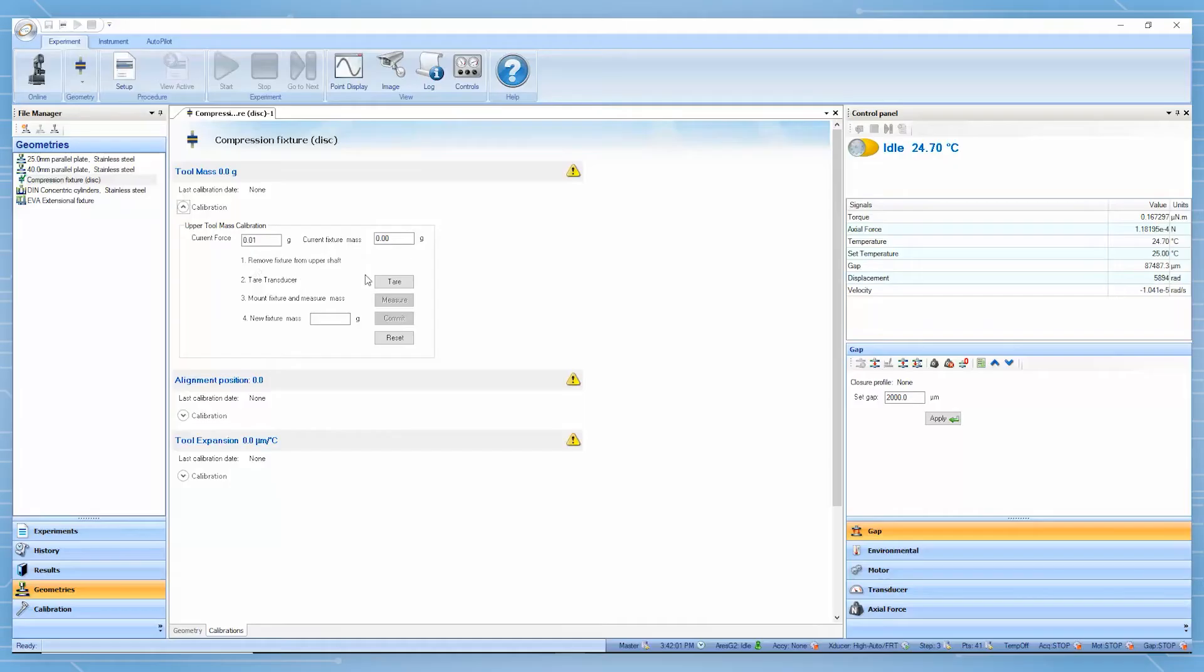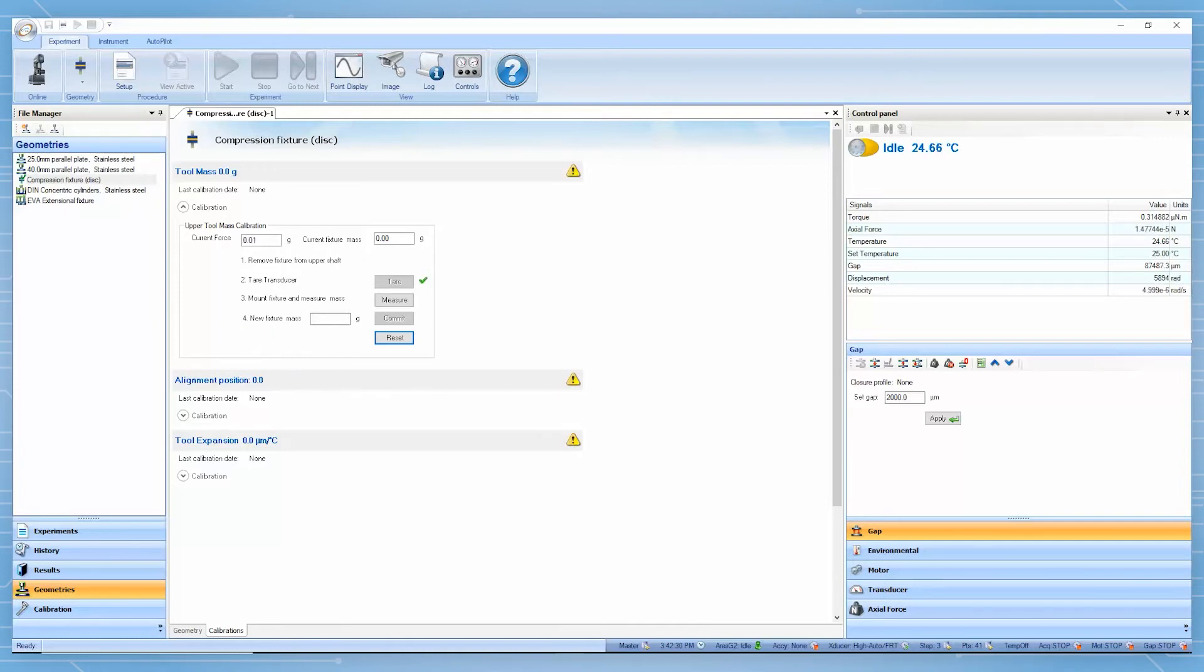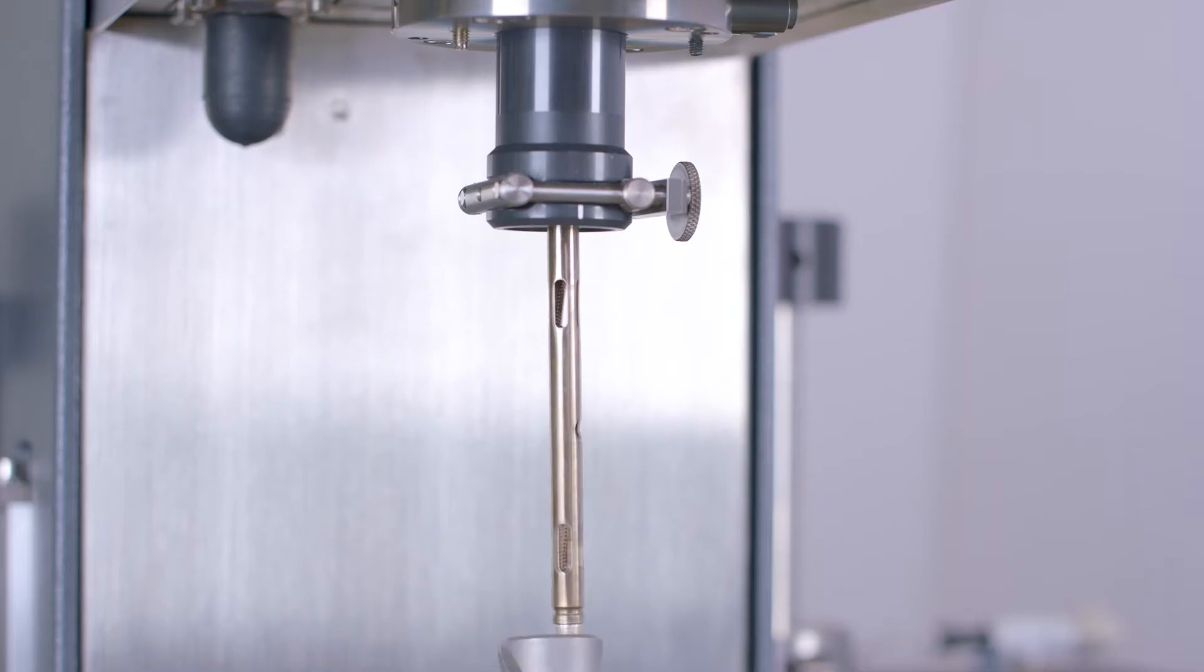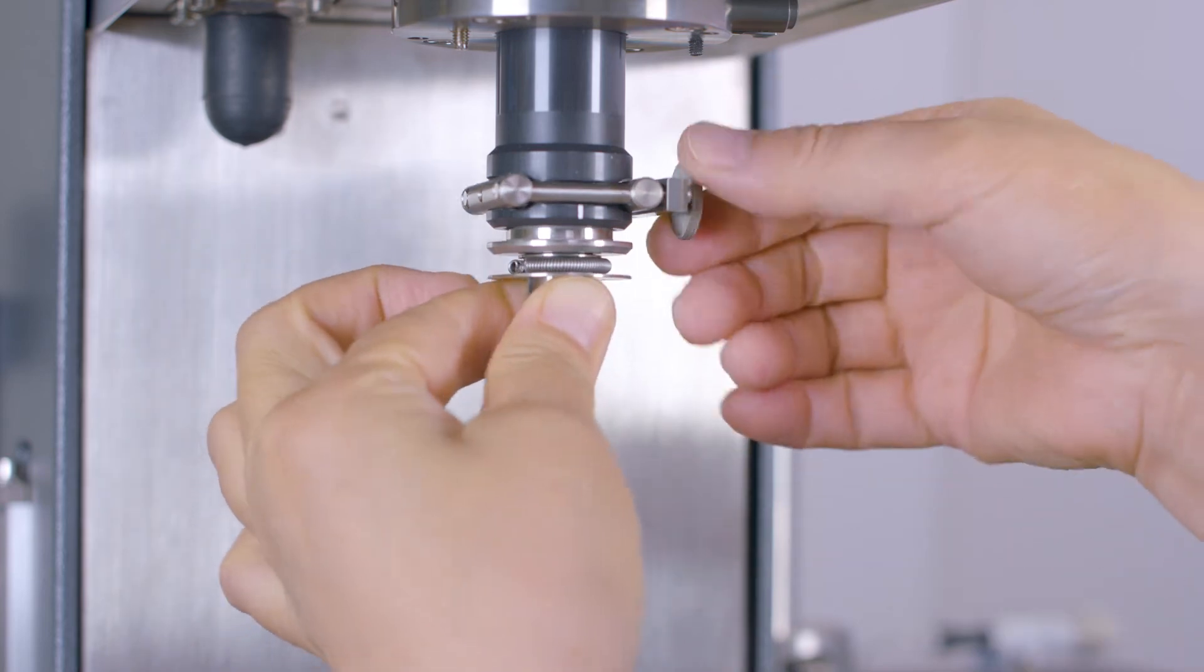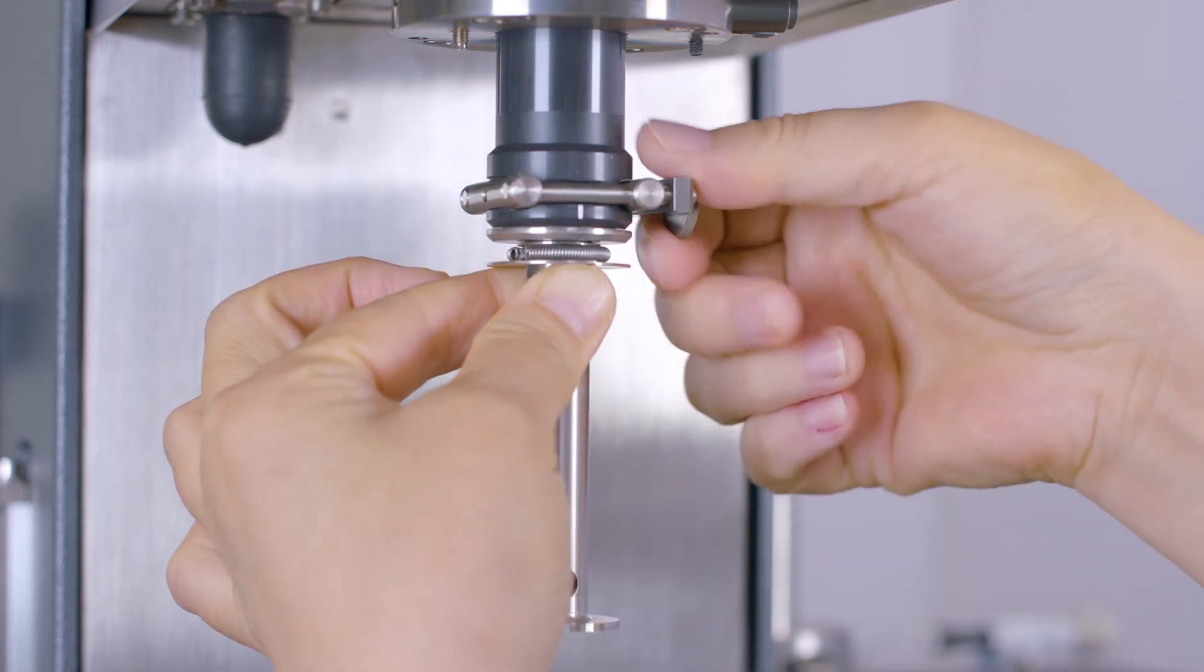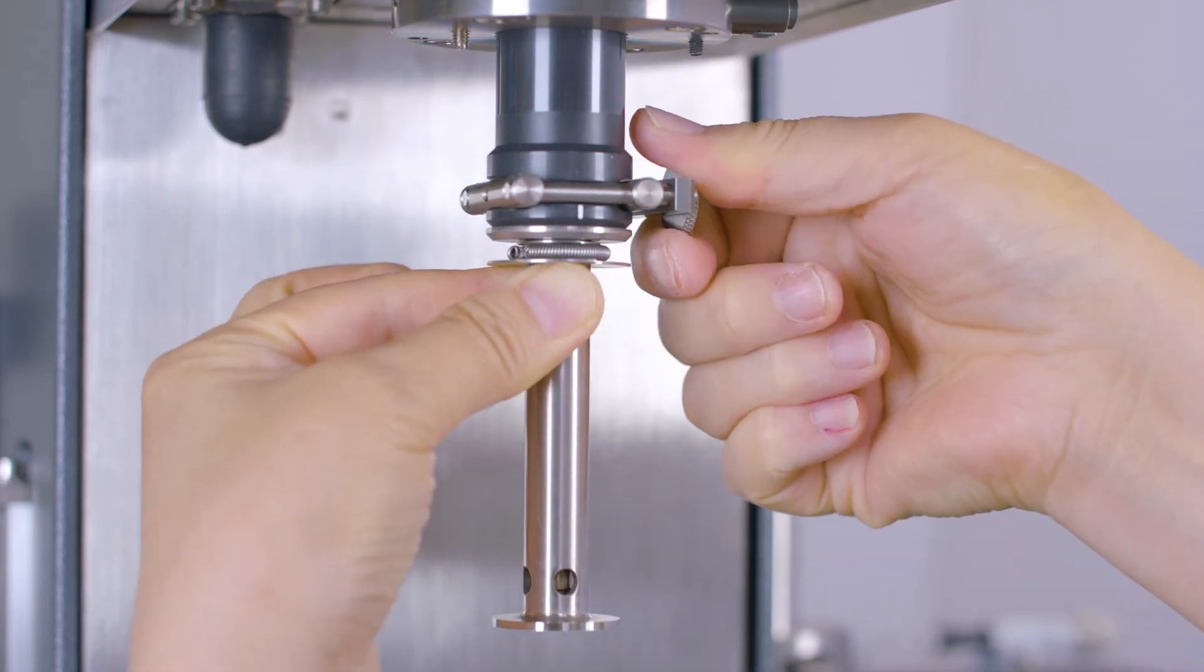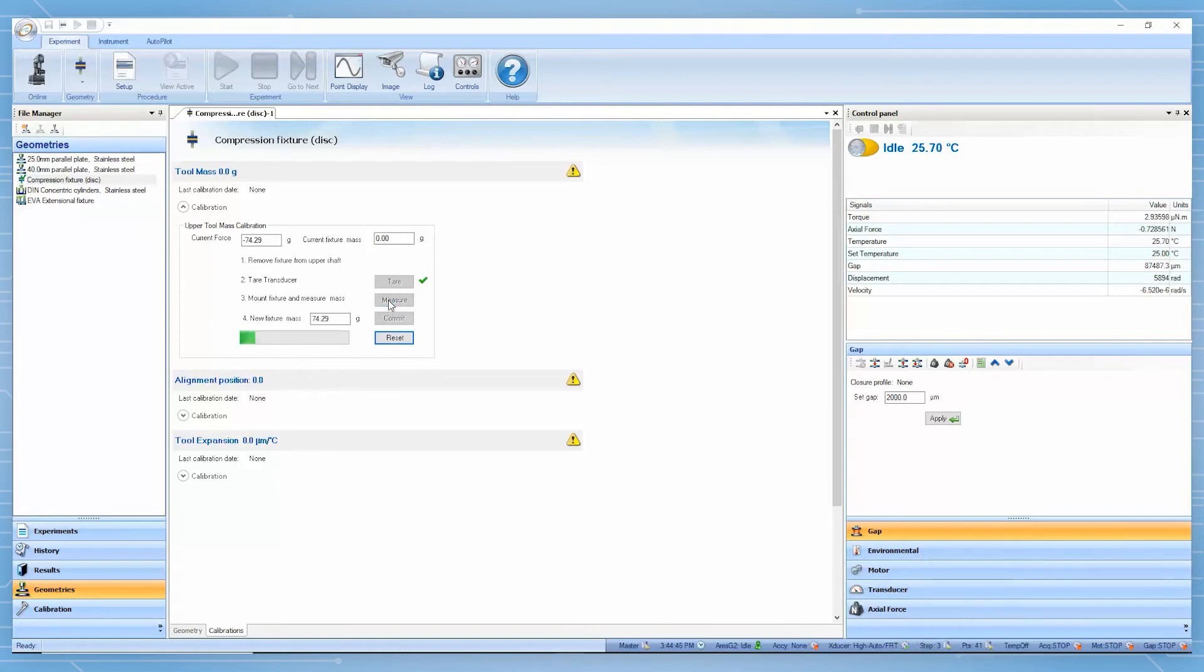Then, click on tare. When this is done, mount the upper geometry and click on measure. After it is completed, click on commit to finish the tool mass calibration.